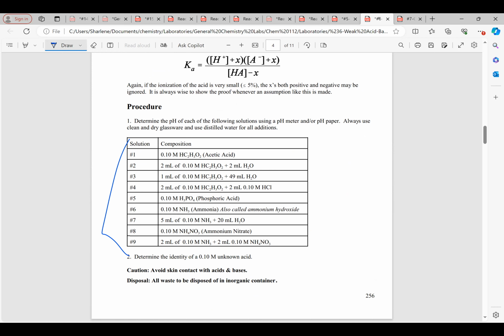Okay, so for 0.1 molar, before I start, did anybody get this far? Does anybody have data that I can use from lab? No. Okay, so these are the numbers that we're going to play with then. So these are going to be the predicted numbers. We're going to predict them today. You are going to do this in lab. It'll take the 30 minutes and make sure that your pH meter is giving you the numbers that we expected.